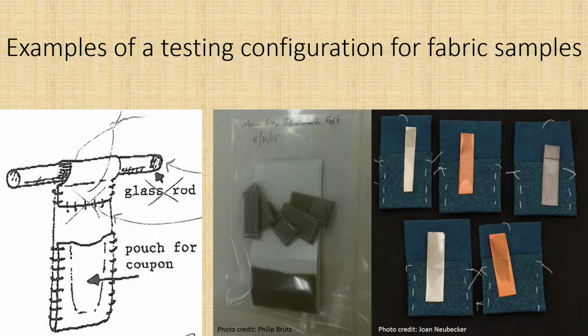While the washed fabric samples are drying, I degrease glassware. All of the glassware is degreased first with naphtha, then with ethanol, and lastly with acetone. It's crucial to use borosilicate glassware like Pyrex for Oddy testing because the water used to raise the relative humidity inside the test vessel will leach alkaline material from non-borosilicate glassware and can result in false negative results, inhibiting corrosion from acidic compounds like those found in wood products.